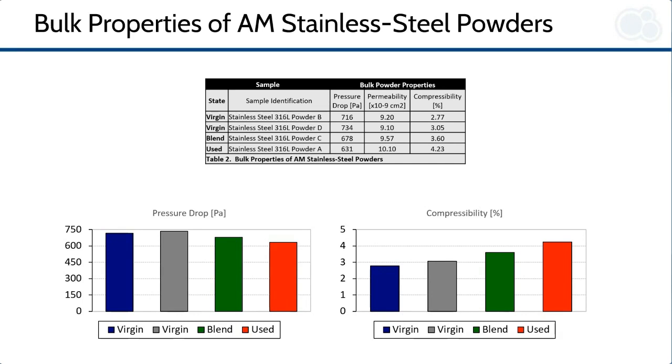Though the used powder tends to compress slightly more than does the virgin powder, flow through the compacted bed is easier for the used powder. It is as if the powder offers less flow resistance. Maybe it is smoother on the surface.